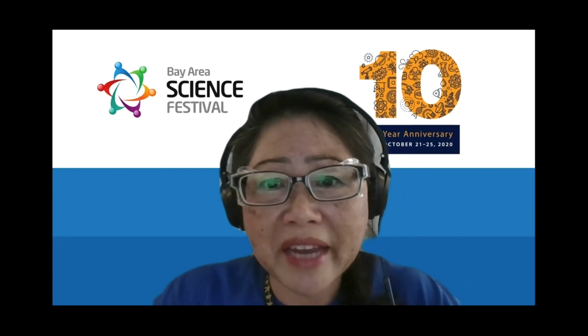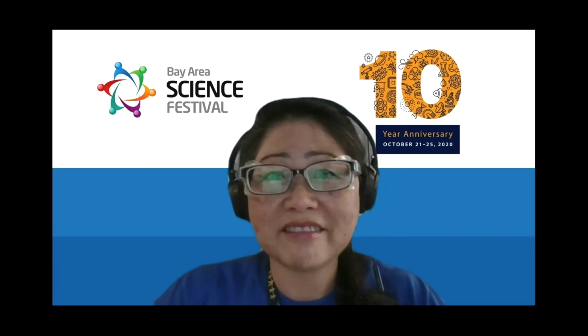Let me see. The next question is from Ade. I'm sorry if I mispronounced your name. Is there a specific air content or pressure needed inside the flask? Sumi, you wanna go for that one? Sure. I know the conditions in the incubator have to be very tightly regulated. I think it's about 1 bar of pressure, and Carlos can correct me if I'm wrong because I know he pointed it out in his video. But the temperature, the CO2, and the pressure, everything is very tightly controlled in the incubator.